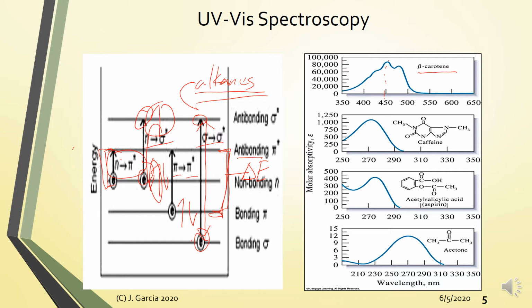And we know for a fact that the color of the solution is the complementary color of the wavelength of the lambda max.